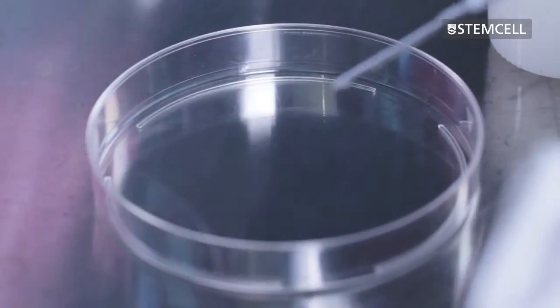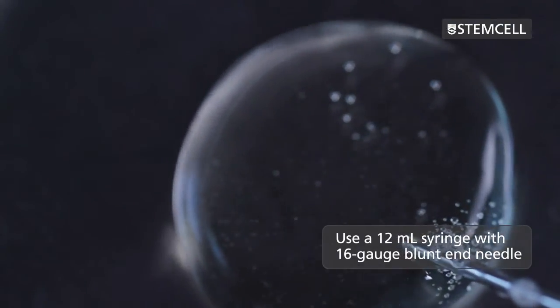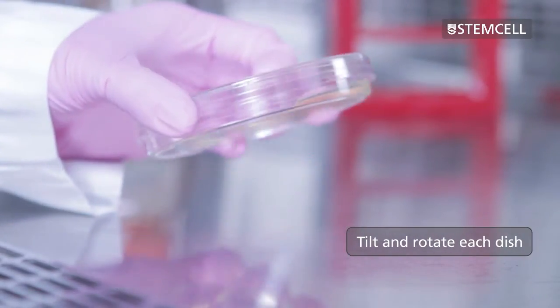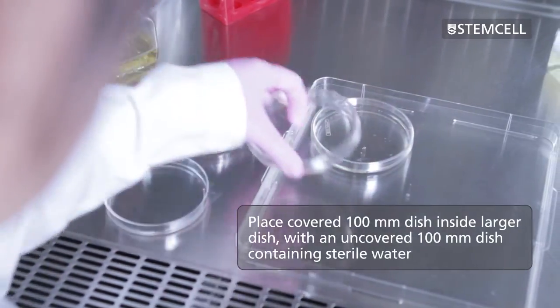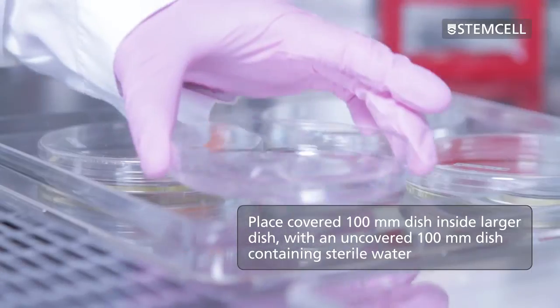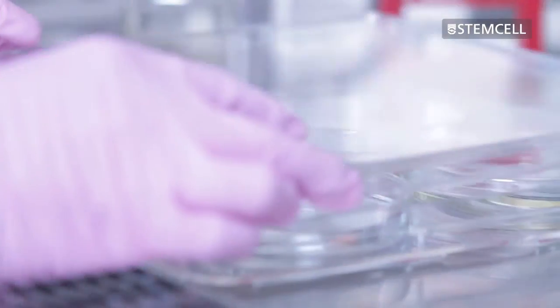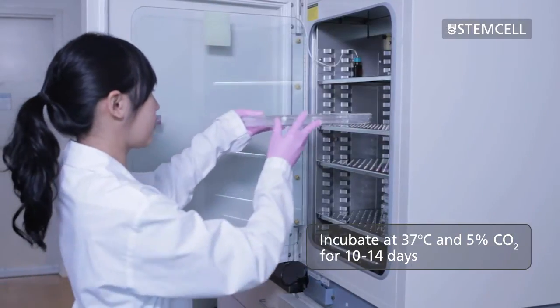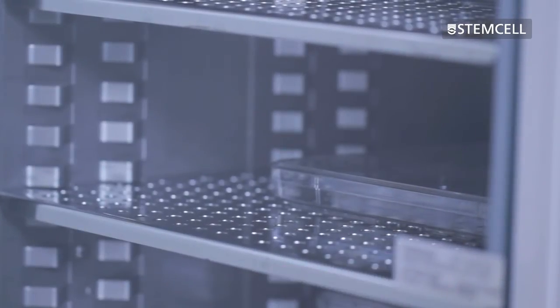Aseptically plate 9.5 milliliters of the semi-solid cell suspension into 100 millimeter dishes using a 12 milliliter syringe with a 16 gauge blunt end needle. Tilt and rotate each dish to ensure that the semi-solid cell suspension is evenly distributed. The covered 100 millimeter dishes may be placed inside a larger dish with an uncovered 100 millimeter dish containing sterile water to help keep the cultures well humidified. Place the cover on the large dish and incubate at 37 degrees Celsius and 5% CO2 for 10 to 14 days. It's important that the cultures are not disturbed during this incubation period.